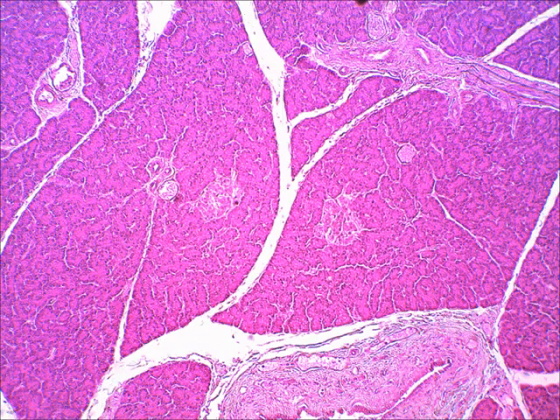You see some other light areas. For example, on the far top left of the screen, look at this light area. This is not an islet of Langerhans. I'm seeing there a blood vessel and a smaller duct that would then empty into the larger pancreatic duct. So you're not going to look for anything with distinct holes in it. That would not be a pancreatic islet because these endocrine areas don't have ducts. They have blood vessels, but they're tiny little capillaries, which are not going to look big and open like you see up here on the top left.